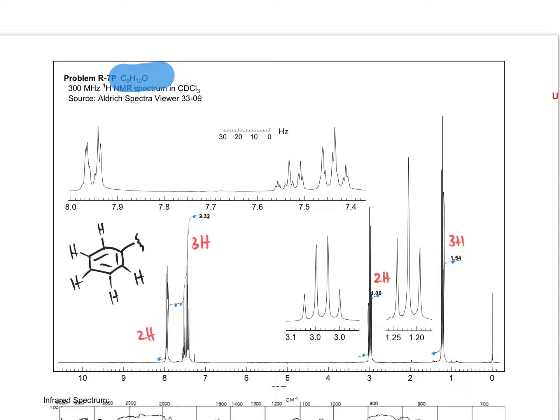Without even looking at the splitting, you have a blowout of a splitting here, and all you can tell about it is that it's quite complex. You can try to read information from it, and the information is there, but you're likely to just spin your wheels and waste cycles on that. It's better to move on to a more accessible piece of information, which are the other 2 peaks.